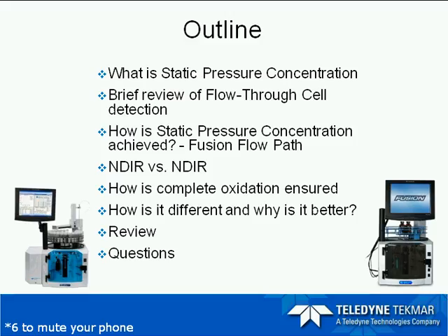We're going to give you a nice solid definition and an understanding of what static pressure concentration is, and then a brief review of flow-through cell detection technology to contrast SPC, or static pressure concentration detection.